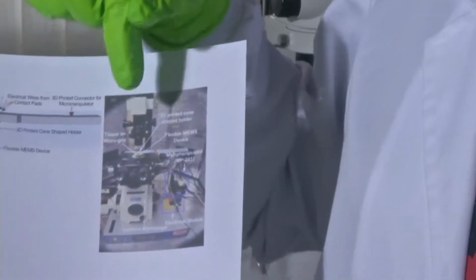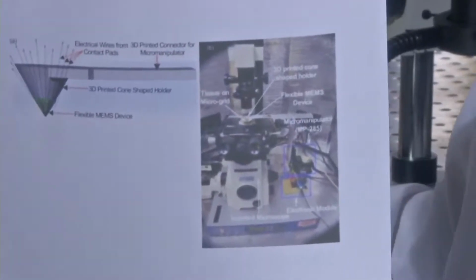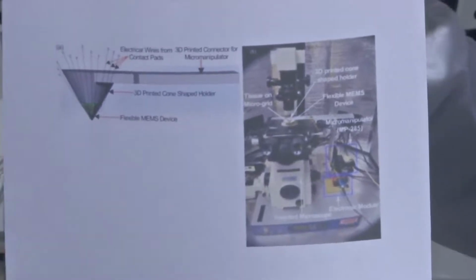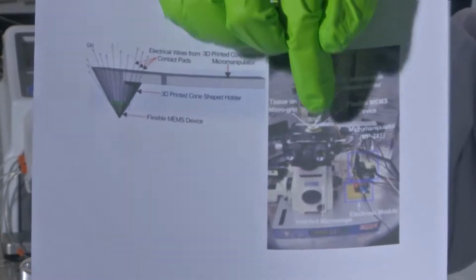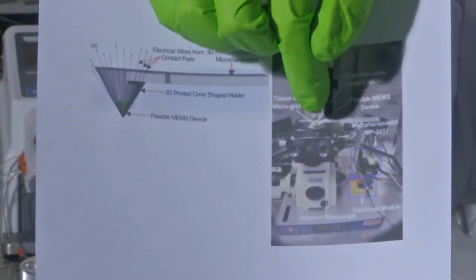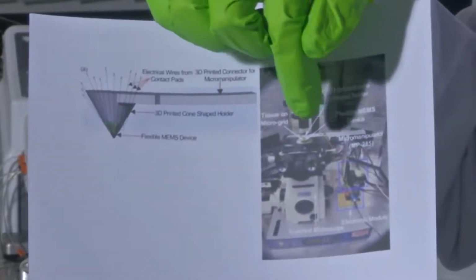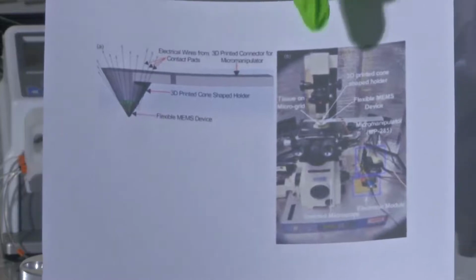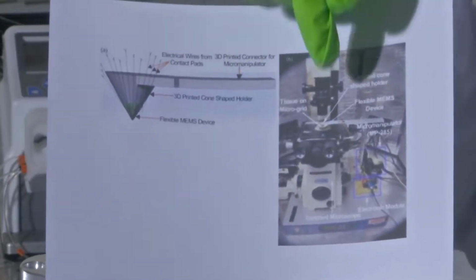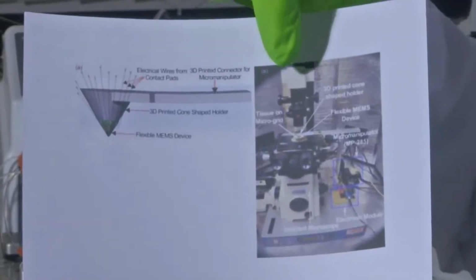Like you see, the manipulator is usually integrated with a microscope. We have understood the functionality, but otherwise in practice they are integrated on a microscope. As I mentioned, we would be working on micron scale cell or tissue samples, and in order to indent them in the right position, you would use this microscope to do the analysis.